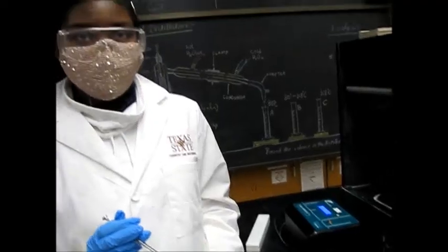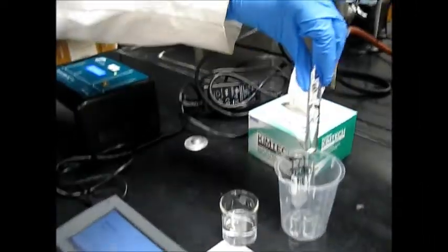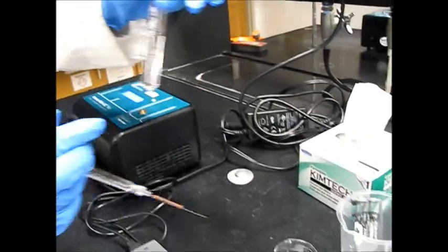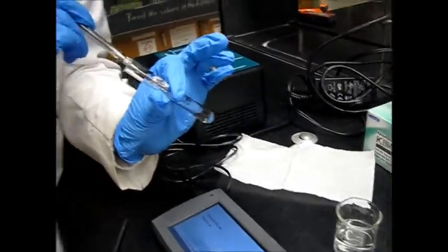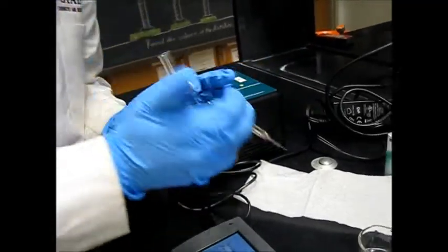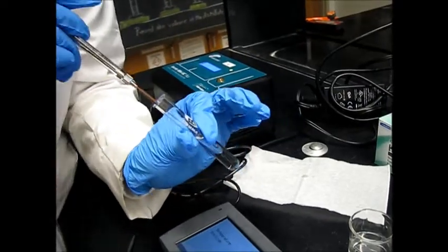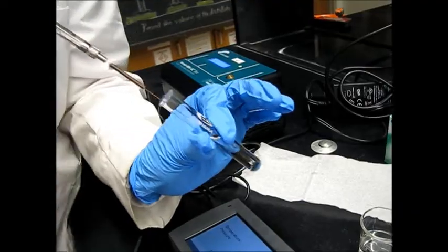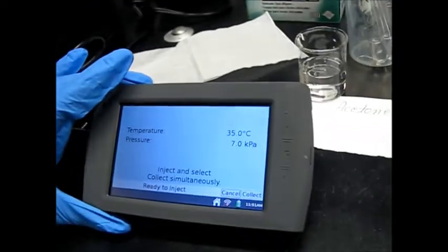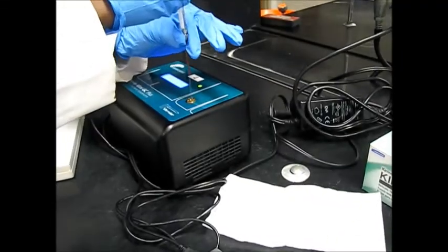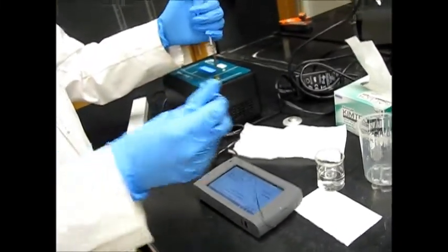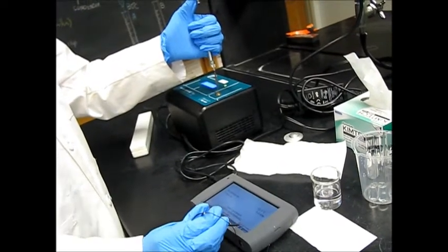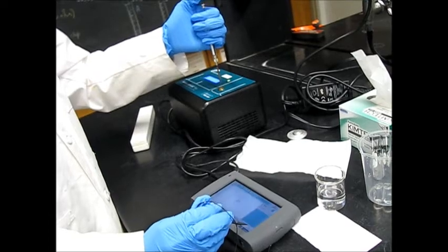Okay, so now we've done section A. So now I'm going to get sample B here. So we are going to run sample B now. So I'm going to start by rinsing it. So I'm going to get about 0.4. So we have to rinse B first. And now I'm going to get about 0.4. And as you can see, the GC is ready. GC is ready. I'm going to slowly insert the needle. And now I'm going to simultaneously press and insert. So insert and press. At the same time. At the same time. So one, two, three. There we go.